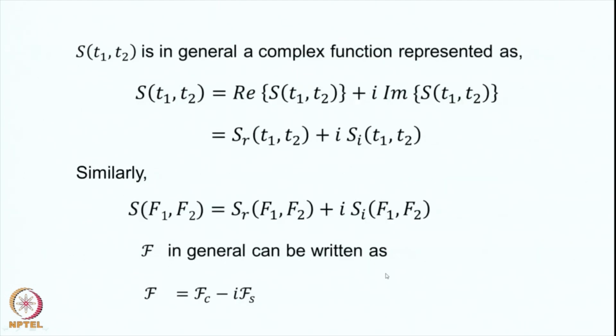Okay. Now generally the time domain function is a complex function. Let me try and explain this to you. We have seen when we do data collection in the one dimensional experiment, you have this frequency axis, and if the magnetization is here and is precessing during the detection period, you have the detection possible here and here.